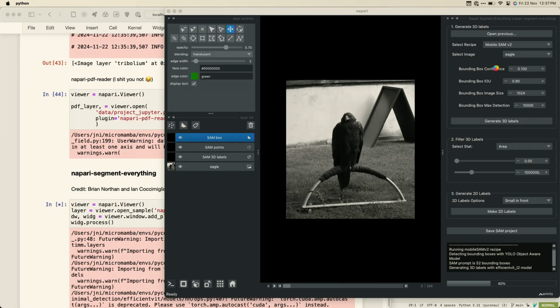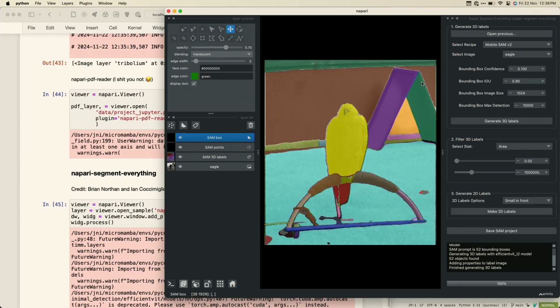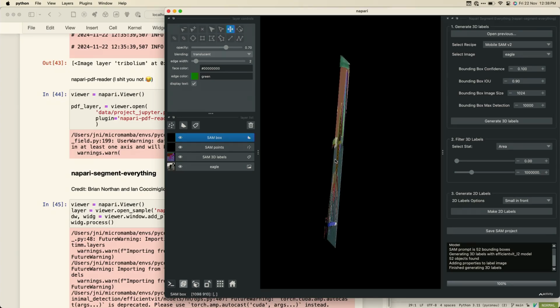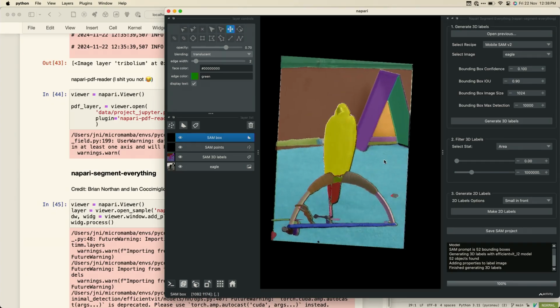And then as you can see, this is a very custom GUI that's just running and doing the segmentation in the background. There's multiple panels. There's a large number of parameters that you can set for it. And all of this was built by the developers in Qt. But one really cool thing about it is that it's called napari segment everything, not anything. So it's not just segmenting one object. There are a number of different seeds passed to it, and then each of the segmented objects is stacked to give you the full segmentation.